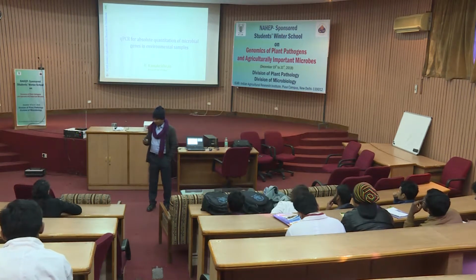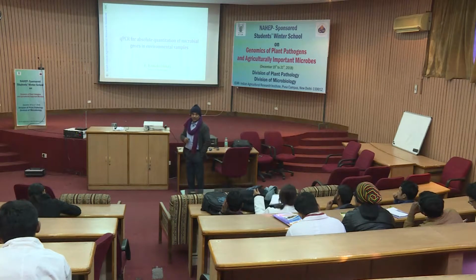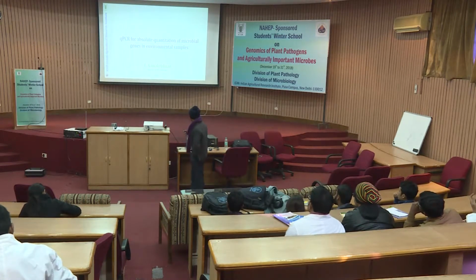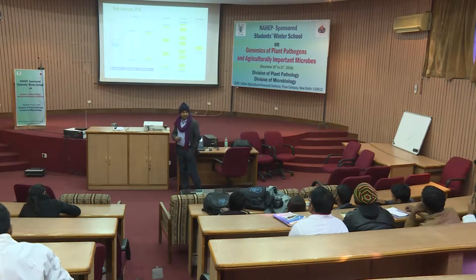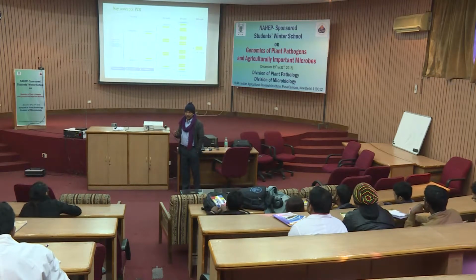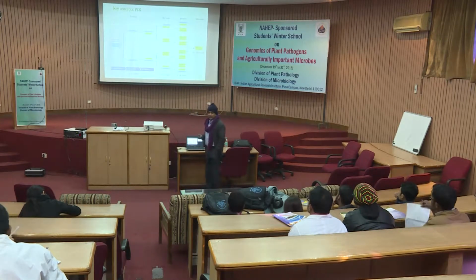About the protocol as well as the key concepts in qPCR for absolute quantification. So we use the word absolute quantitation of microbial genes in environmental samples using qPCR. I think Dr. Kumar gave you an overview and a nice perspective on PCR and qPCR 2 days back. And we all have some ideas about PCR reactions.